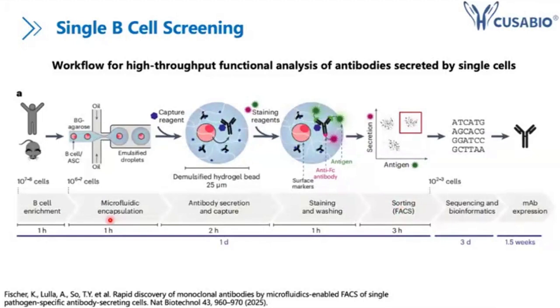Except for the previous two, high-throughput sequencing is pretty straightforward. For this one, we directly use 10x Genomics or some other instrument to get the single cell antibody sequence. So we directly sequence the single cells and perform antigen and antibody protein structure prediction and analysis to get the target antibodies. The basic idea for this platform is that you get the single cells, do the sequencing, gene amplification, and recombinant expression, and then get the target.